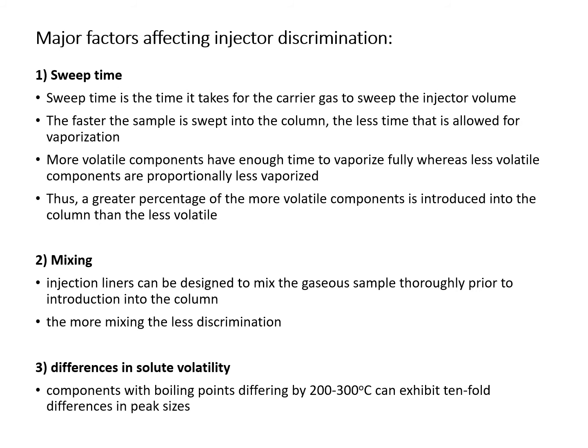So class, let's move on to the major factors affecting injector discrimination, which is the sweep time. Sweep time is the time it takes for the carrier gas to sweep the injector volume. The faster the sample is swept into the column, the less time is allowed for vaporization.